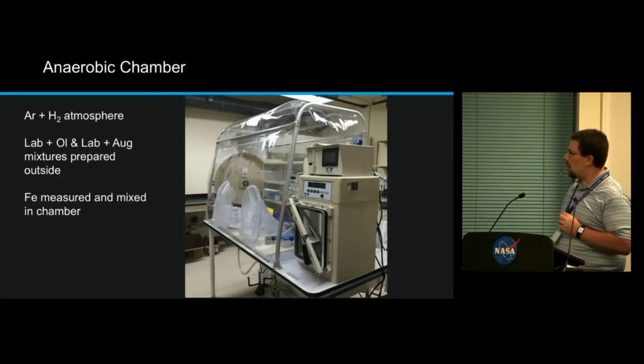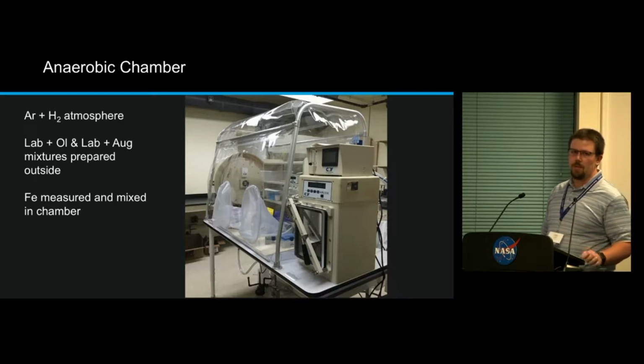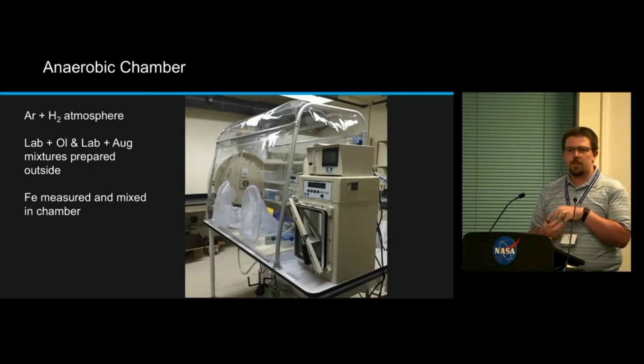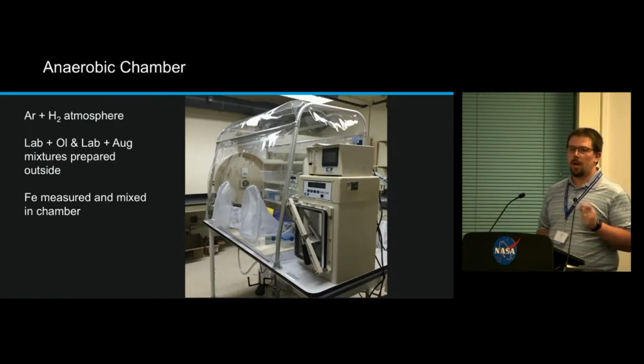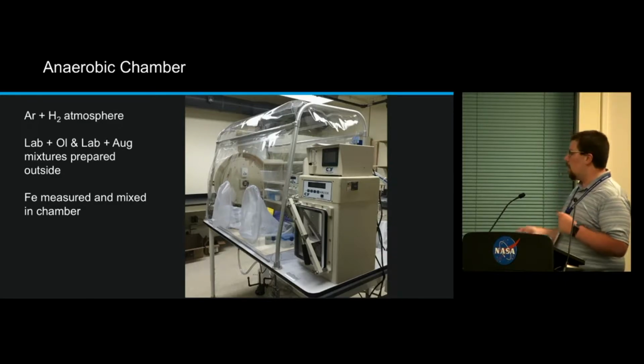We did this all at Temple University in Steve Kim Taub's anaerobic chamber, so that the iron nanoparticles were never exposed to air and water. The idea here is if you expose a 30 nanometer iron particle to the Earth's atmosphere, you no longer have a 30 nanometer iron particle, you have a 30 nanometer iron oxide particle. And so to avoid that, we just did everything in an argon environment.